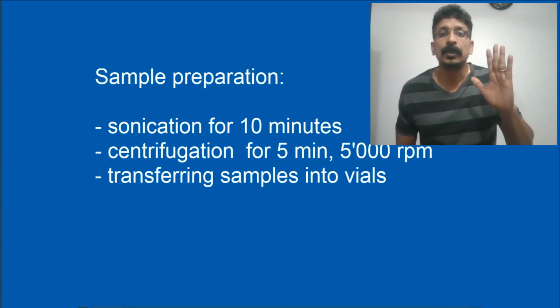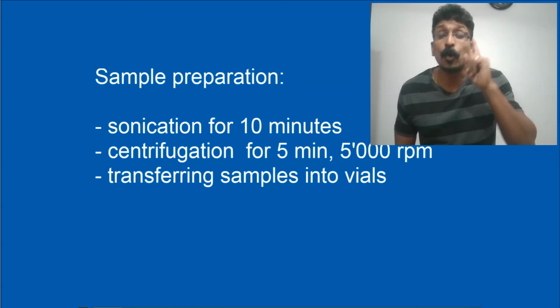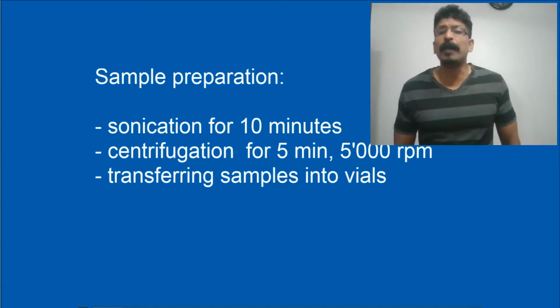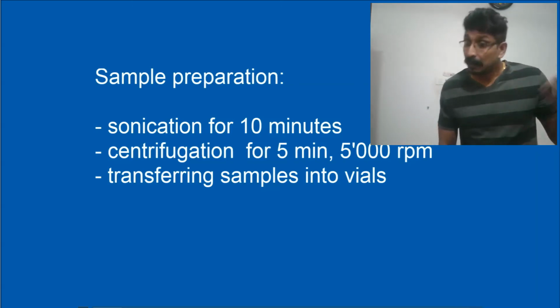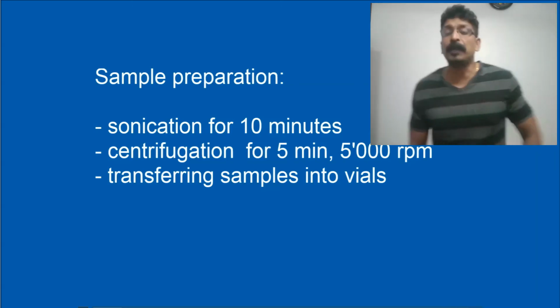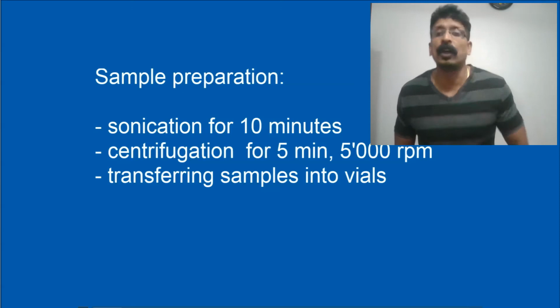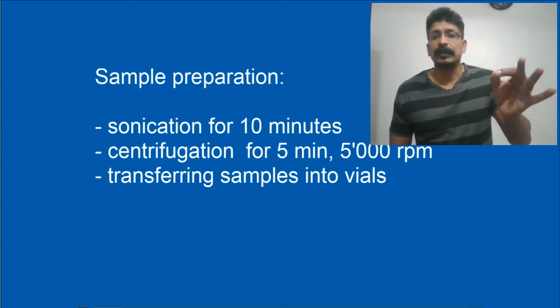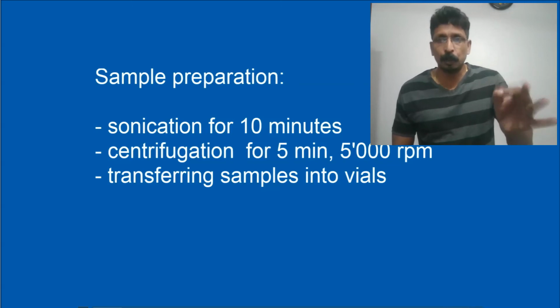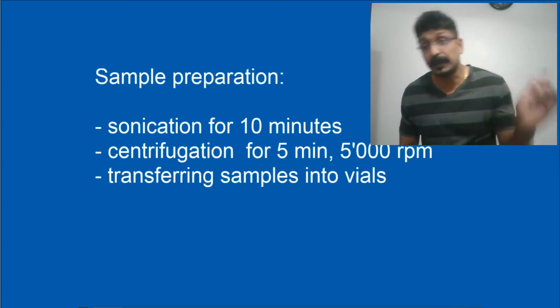That is sonication for 10 minutes. What do you mean by sonication? Sonication means ultrasonic waves will be used for solubilizing. They will keep the test tube in the ultrasonic vessel in a liquid. It will solubilize by means of the ultrasonic waves moving inside the liquid.